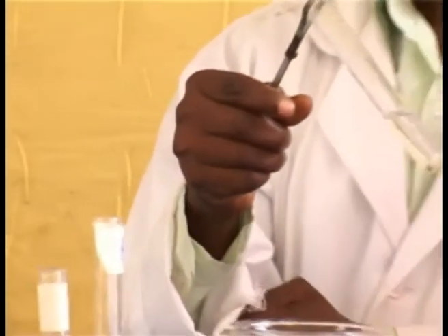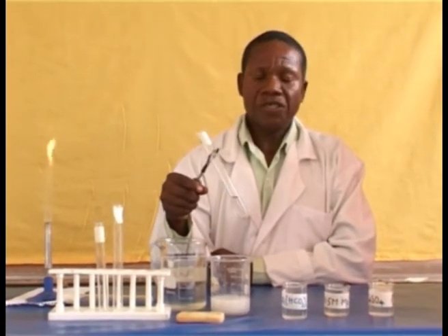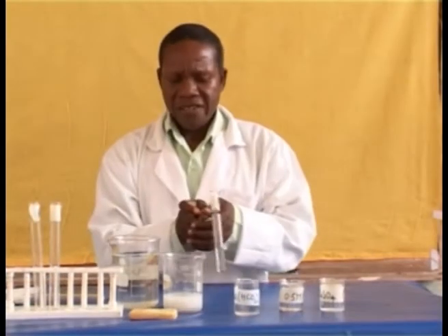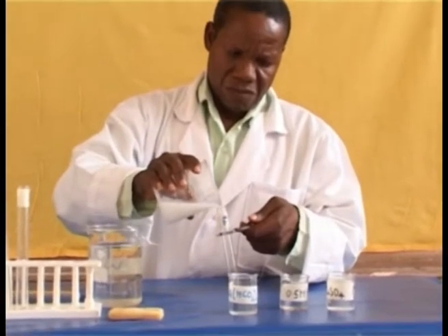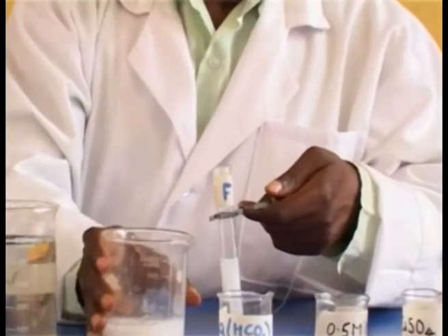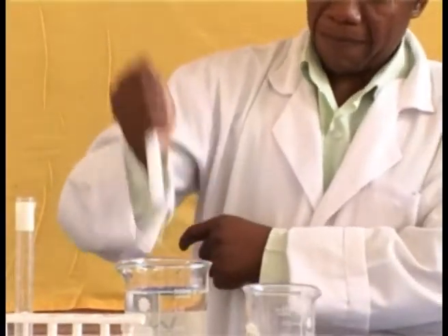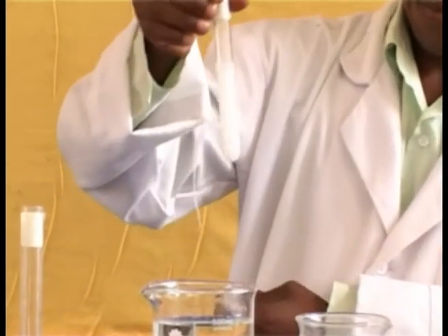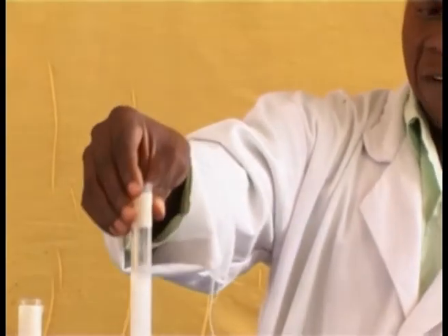Okay, our solution boiled, and then we need to cool it so as to continue the experiment using a cooled solution. Add soap solution. Shake and observe. Even after boiling, no lather formed.